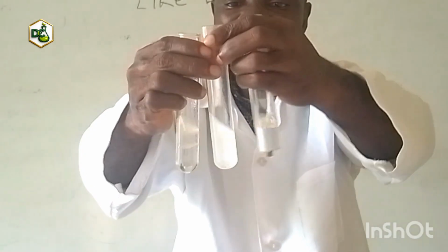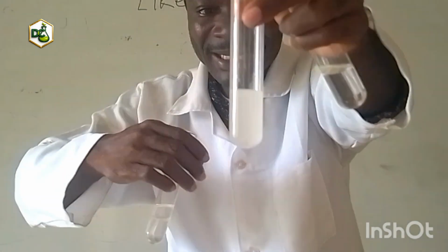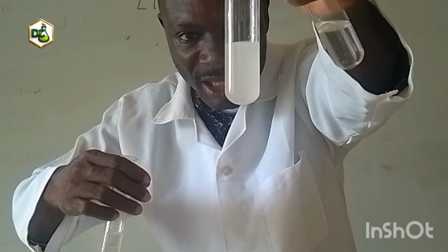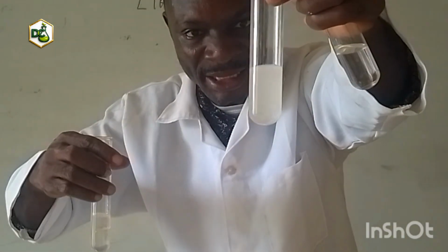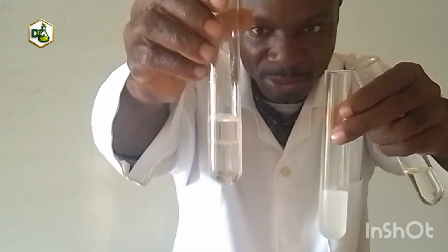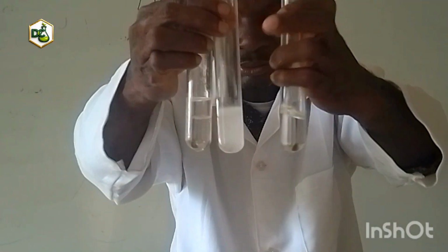Now, in this middle condition, we are not seeing any distinct boundary, no separation, but it's cloudy. We refer to this as sparingly soluble condition. And then here we have two boundaries formed. So we call this one insoluble or immiscible condition.